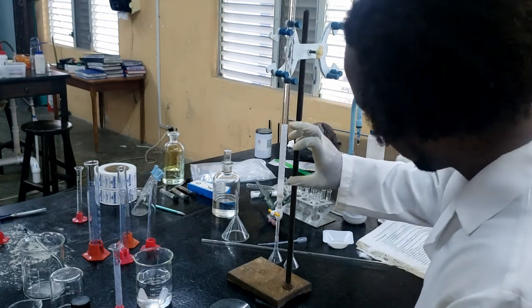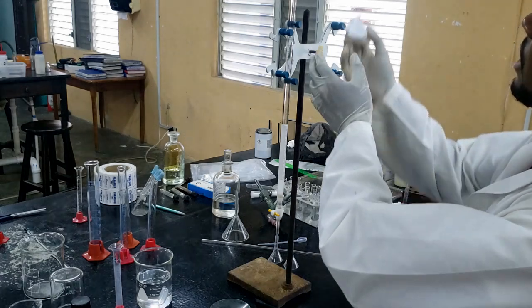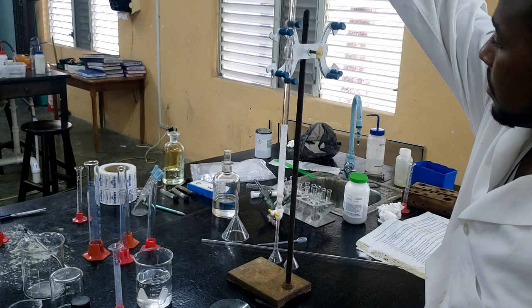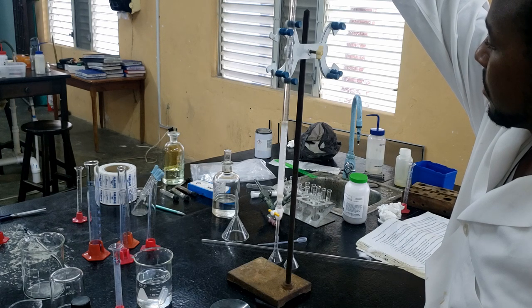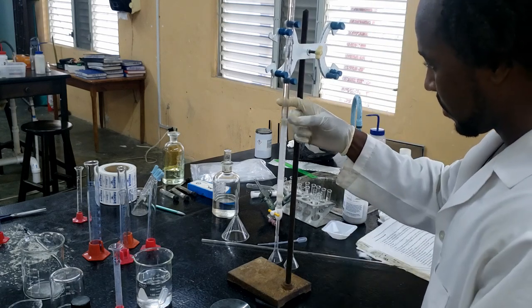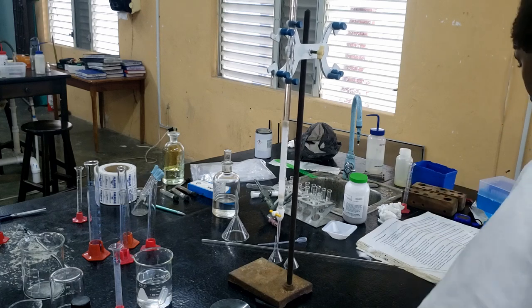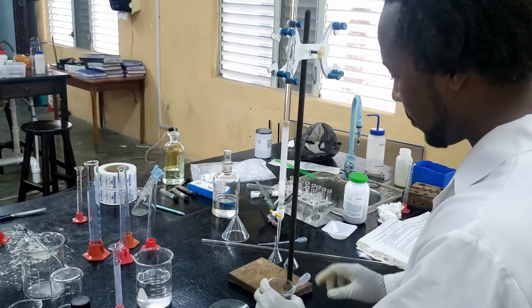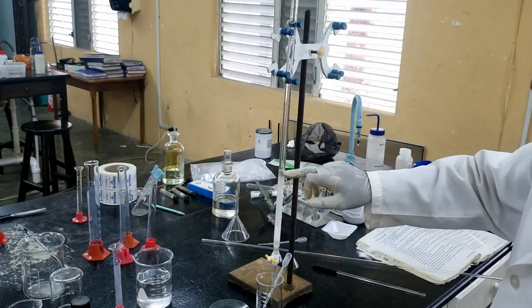Okay, the silica has settled. Now we get another amount of sand. So we're going to add another 0.5 cm³ of sand on top of that silica. Once you've done that, we're going to now run this eluent out until it's just about the level of the sand.